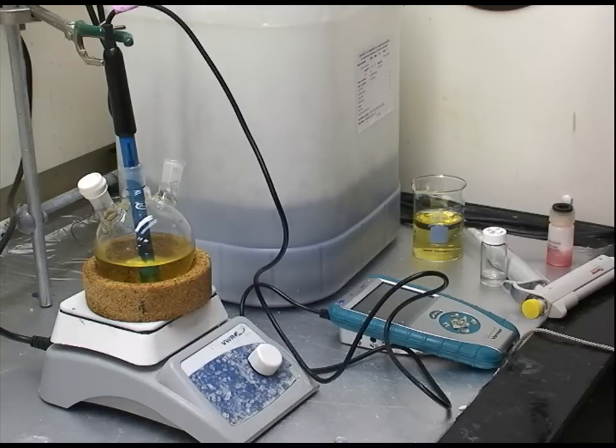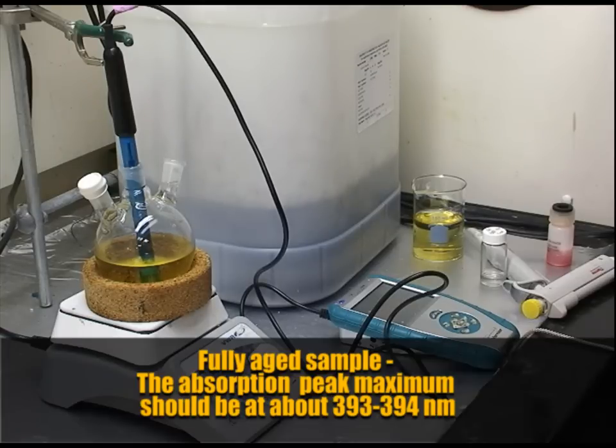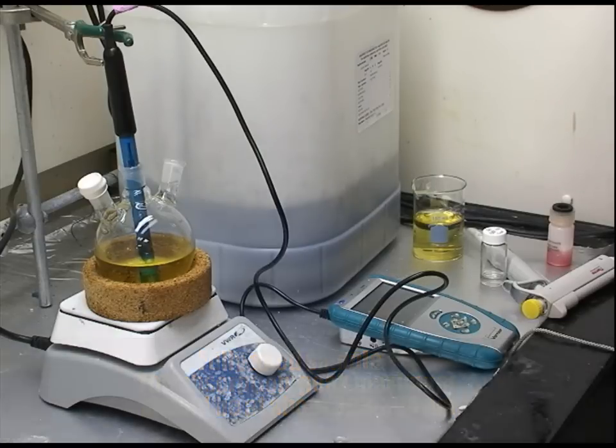After aging 15 hours, the absorbance of the sample should be at about 393 or 394 nanometers, which will indicate that it has been sufficiently aged.